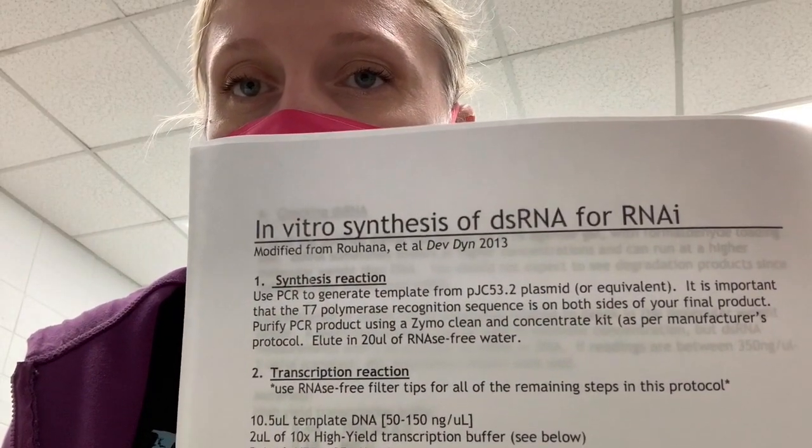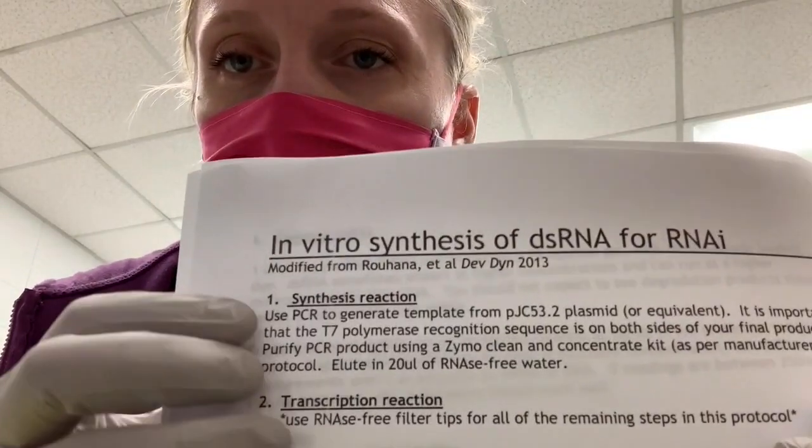This video is going to help you begin the process of synthesizing double-stranded RNA. The protocol that we'll be using in this video is in vitro synthesis of double-stranded RNA for RNAi. And you'll see at the beginning there's a synthesis reaction here, and it says use PCR to generate template from PJC 53.2. Purify and elute in water.